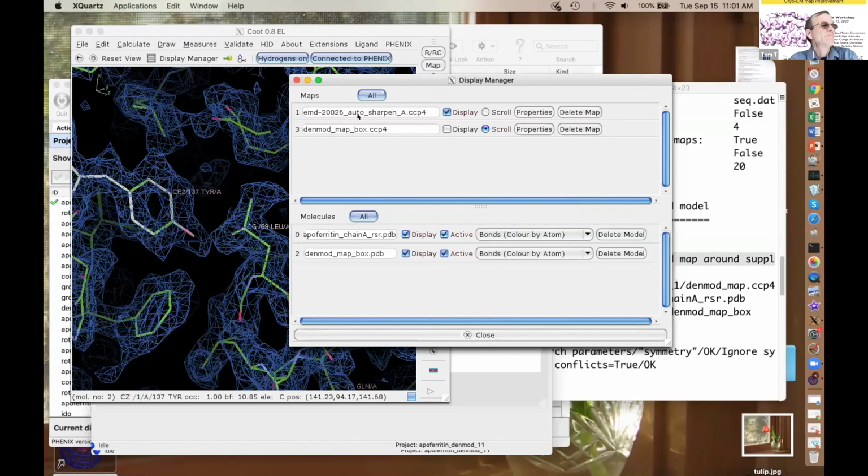Yeah, that definitely. And Andre, on solvent that's inside the protein, density modification should be fine for that. It will treat that solvent as if it's protein, that is, as if it's ordered, and not try to flatten it or anything. Suppose you have a very high resolution map and you're trying to see some solvent molecules that are inside the protein, it should be no problem. It should be fine to look at it with a density modified map.